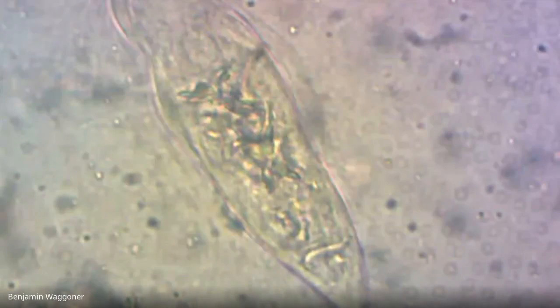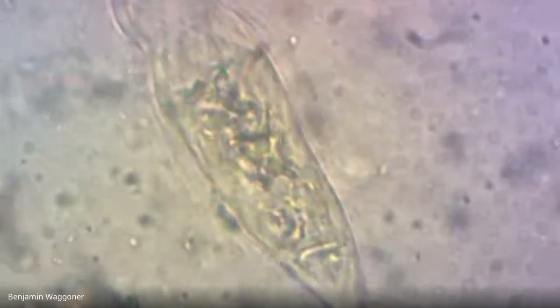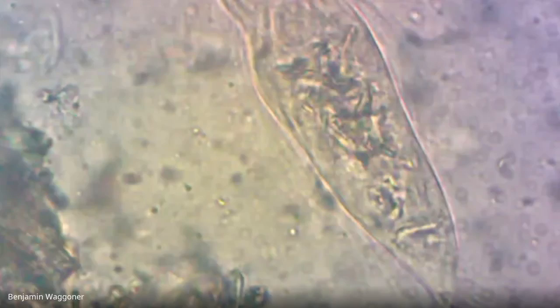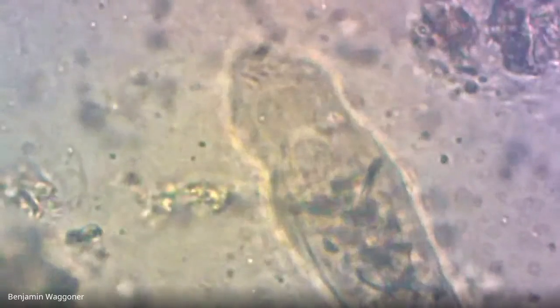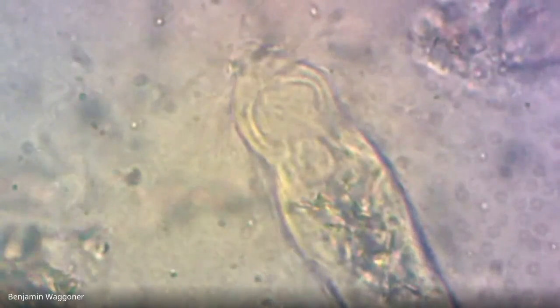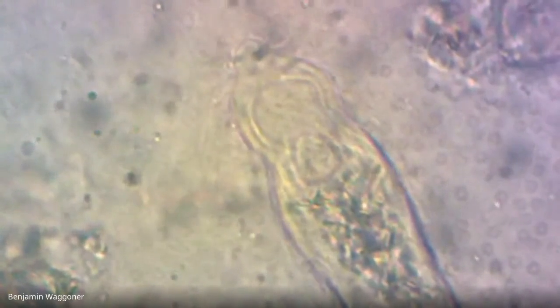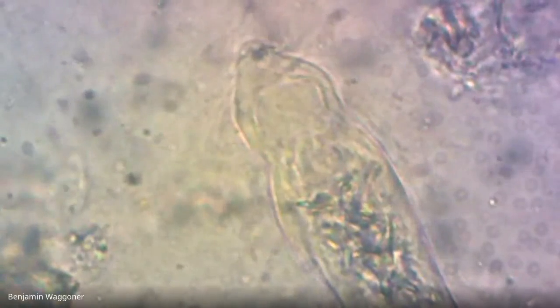okay, this bad boy is not moving very much, and I think he may be dying. They're usually more mobile than that. But if you look, right there's kind of his midsection, or hers, for all I really know. And if you look up here, that's the anterior end. And the anterior end ends in what looks kind of like a nose cone.